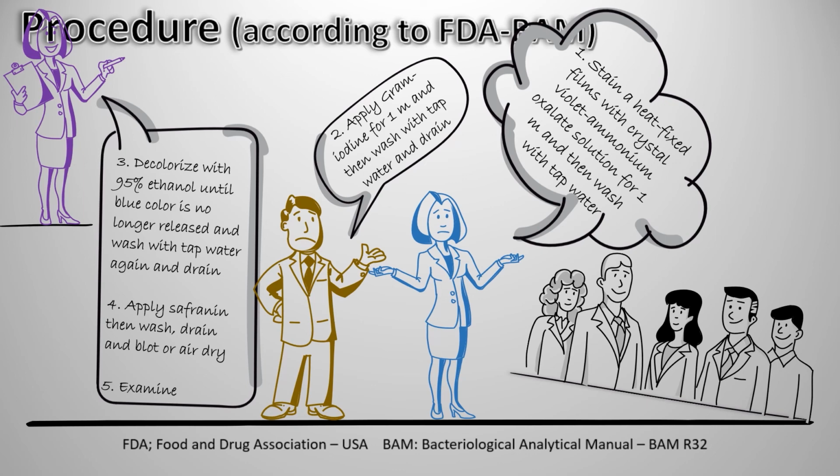You can't make those steps practical, and you can't see anything but blackish coloration, or because of the much presence of the crystal violet, you can see even the gram-negative bacteria as purplish. This is the most important thing you have to know.